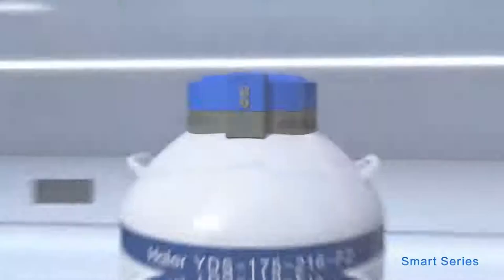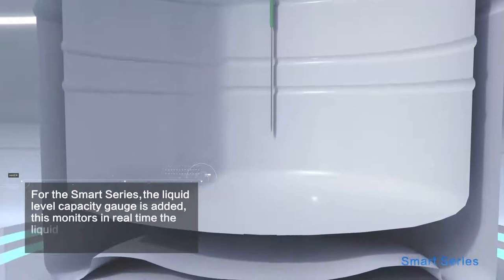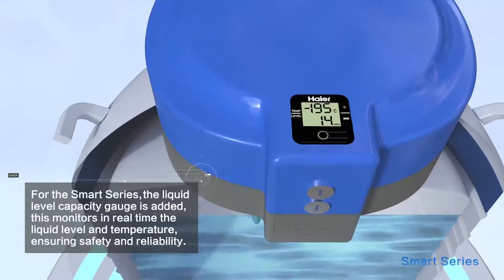For the Smart Series, a liquid level capacity gauge is added. This monitors in real-time the liquid level and temperature, ensuring safety and reliability.